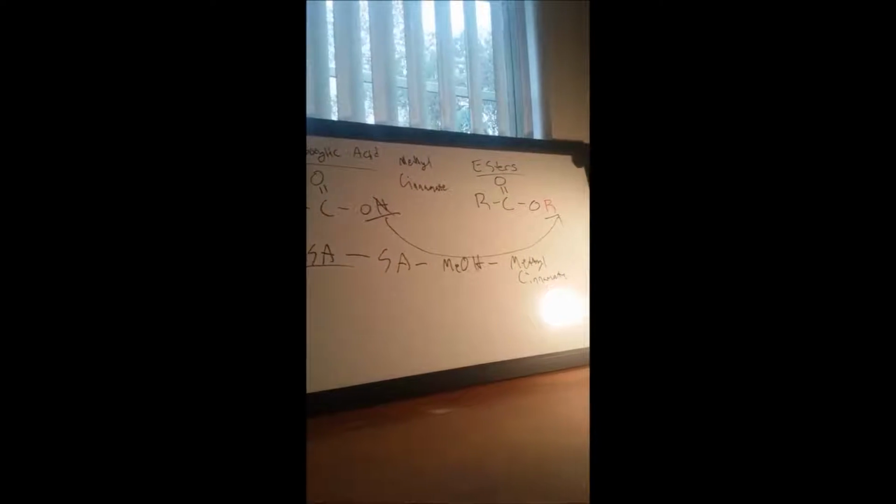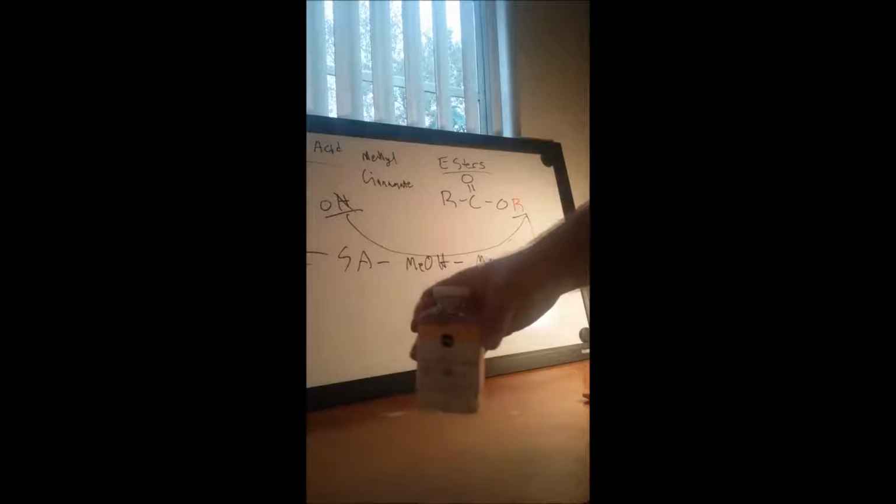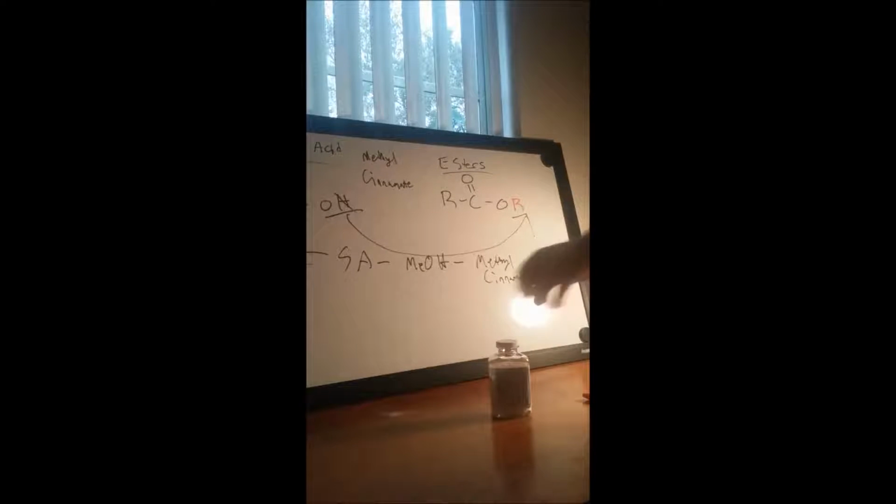Now, there is a very convenient source of acetylsalicylic acid. If I can move this without destroying my camera setup. I'll just pretend that didn't happen. In the form of aspirin pills. There's a bunch of videos that already cover the history of aspirin pills, specifically how they came about, the varied uses, etc. Everybody's familiar with it.